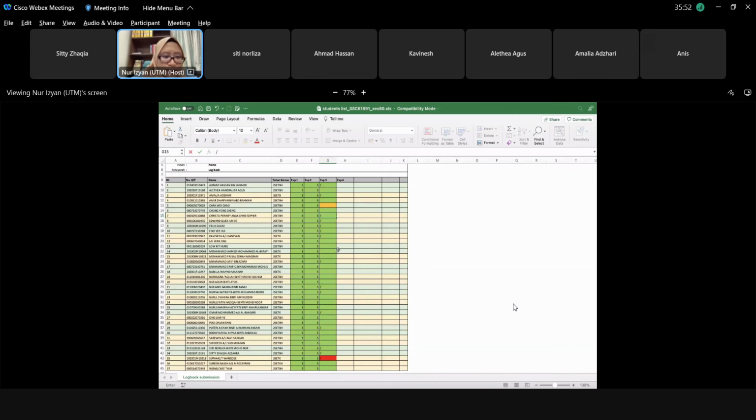Muhammad Ahmad. Yes, doctor. Okay. Can you mention the constitution of the standards being prepared by Dr. Faizwan? There are 5 standards with different concentrations: 0.1, 0.2, 0.3, 0.4, 0.5 ppm. Okay, thank you. Very good.